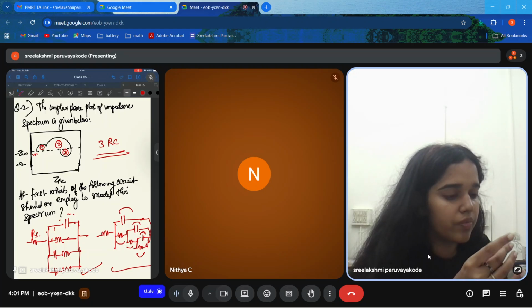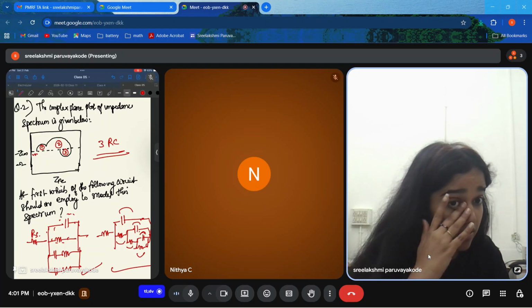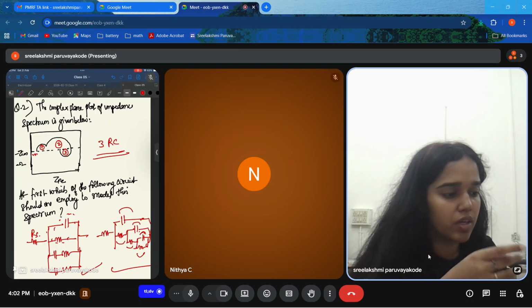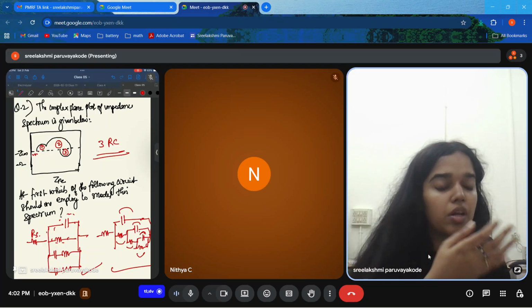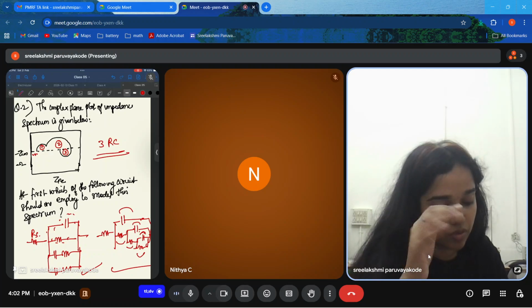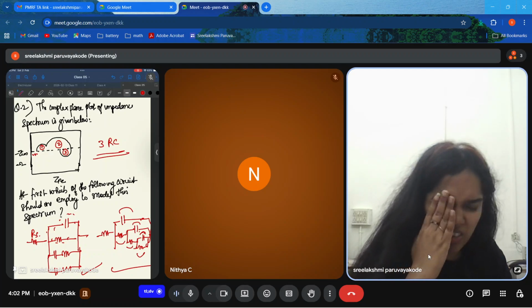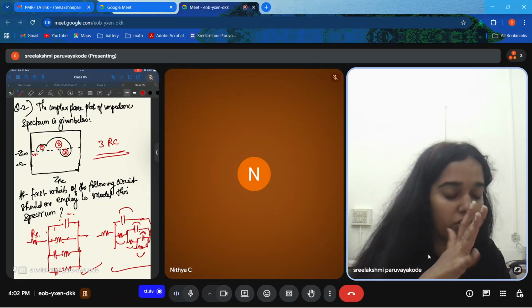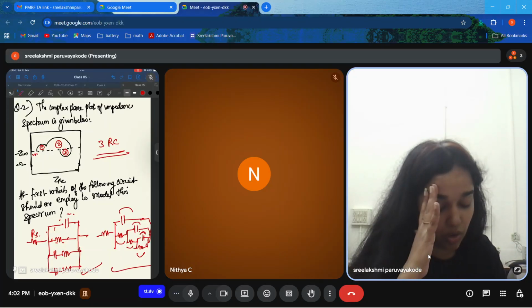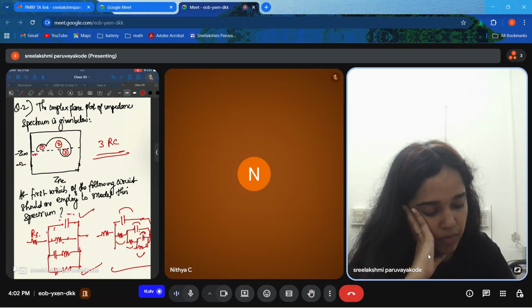Yeah. So here your circuit has an inductor, but you're still using a resistor and capacitor in parallel in order to fit it, because you know that you can fit an inductor using RC if they are allowed to go to negative values. So yes, this can also work. Now, how to find out for such a system what is RP and RT value? It is a little, not complicated, but if I explain that, let me use this Maxwell circuit.